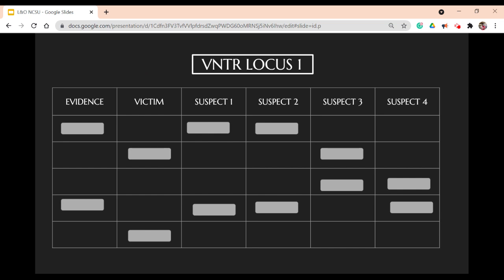This is the gel results of the first locus. After some analysis, we see we have a correlation on the first locus for Suspect 1, Petey the Pirate, and Suspect 2, Ramses the Ram, with the evidence collected from the crime scene. We also see that the bands on Suspect 3 do not match the evidence at all, and only one band on Suspect 4 matches the evidence, so they are less likely to be the thief.